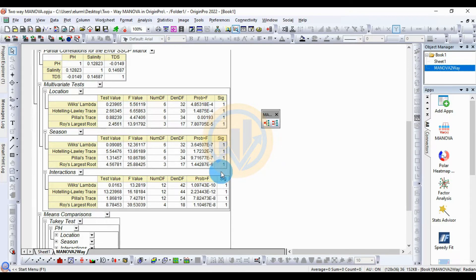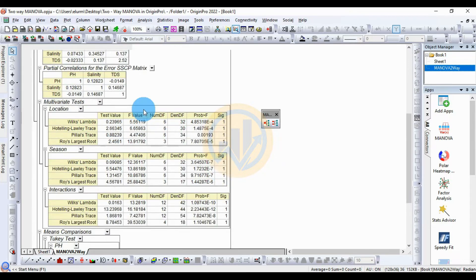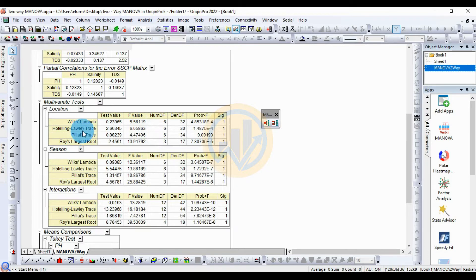A significant indicator of 1 means statistically significant; a value of 0 means statistically non-significant. For location, season, and interaction, all multivariate test significant values are 1, so all tests are statistically significant. For Hotelling's trace, the test value is 2.66345, the F value is 6.65863, with numerator df of 6 and denominator df of 30.